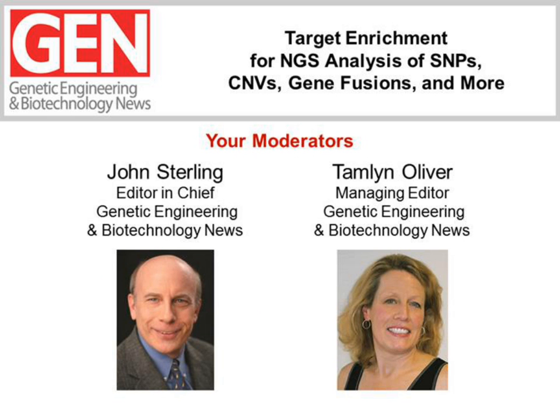Targeted resequencing is one of the fastest growing applications for next-generation sequencing technology. The ultimate goal is to look for causative mutations within discrete genomic loci in populations to enhance the development of new diagnostics and therapeutics. During today's webinar, a novel next-gen sequencing target enrichment method that utilizes single primer enrichment technology will be described and discussed. The approach has applications in the identification of gene fusion events in RNA samples, target gene expression analysis, variant detection, and copy number variation analysis in DNA samples.